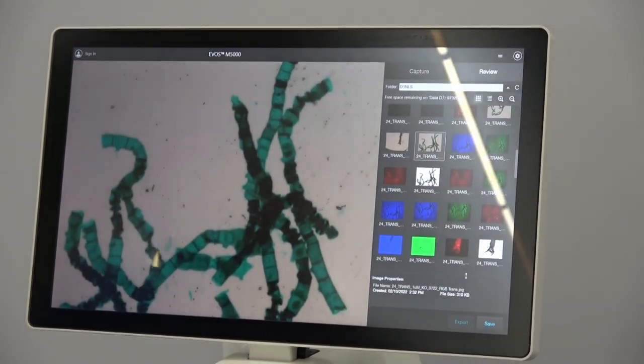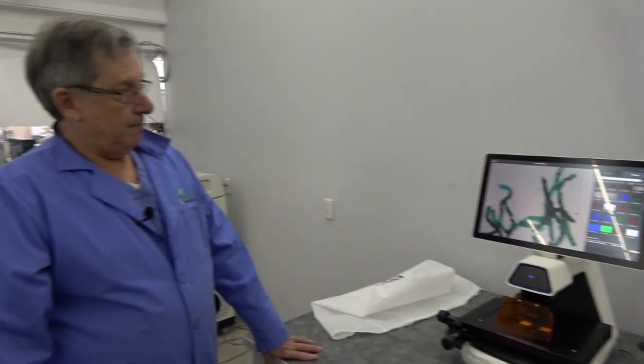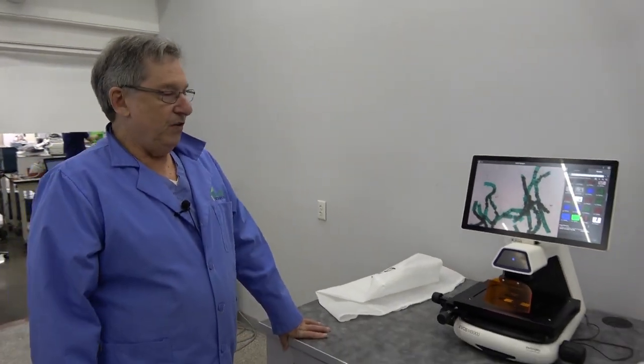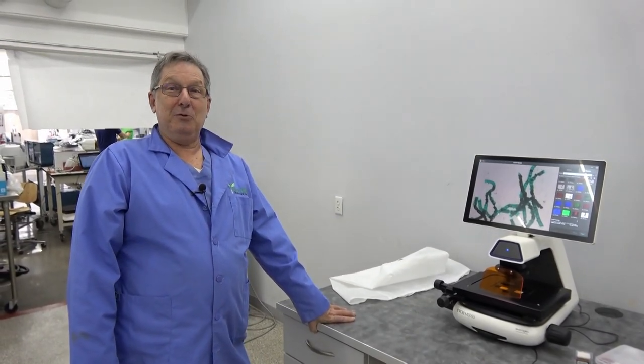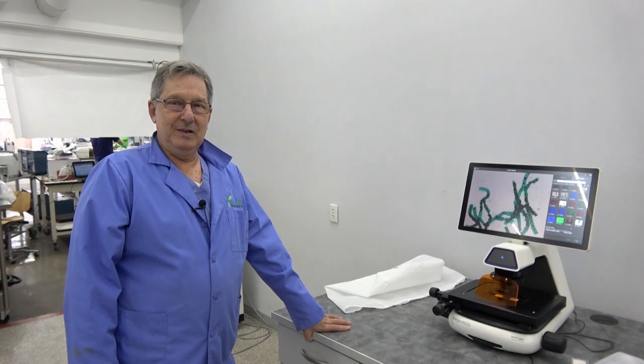Well put together. Again, not our specialty, but we were very impressed, and I think you will be too, when you make this M5000 yours. Thank you.